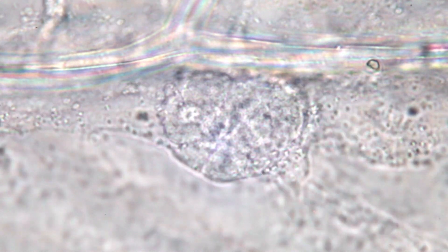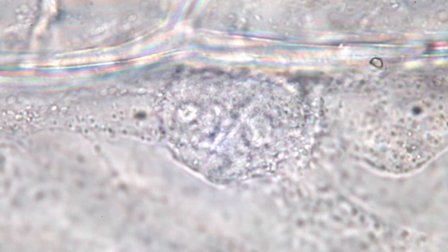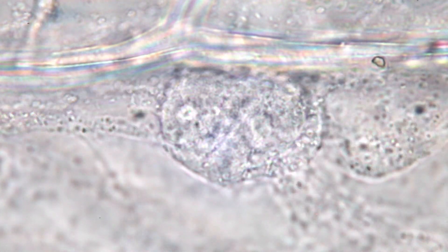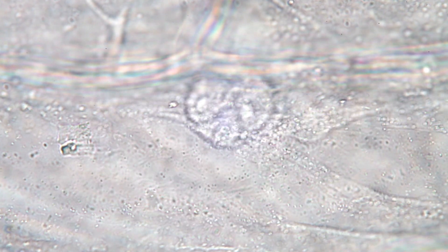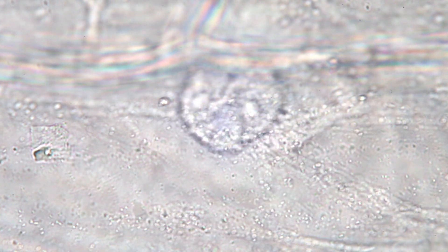At a higher magnification you can see quite a lot of activity going on around the nucleus, and you can actually see certain paths along which the vesicles move. Again in time-lapse at 20 times the original speed — we call this cytoplasmic streaming. Some people also like to observe this in water plants called elodea. I actually did make another video of that, and in elodea you can actually see the movement of the chloroplasts, which is also quite interesting.